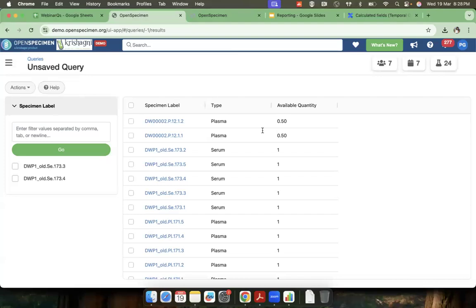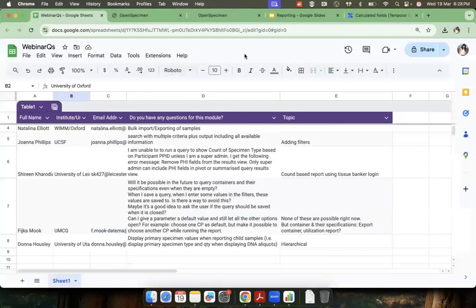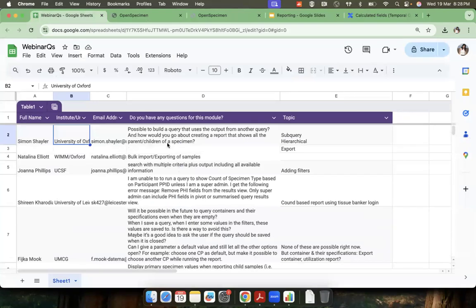Okay, any other questions? If we have a few minutes left, you can now unmute and ask the questions as well. I'm just also quickly going to see the webinar questions that we had.